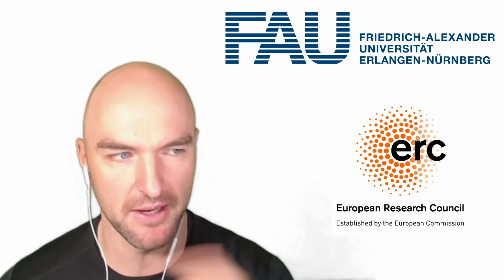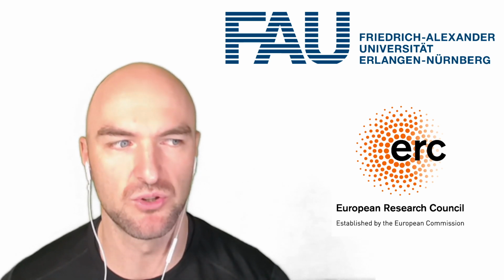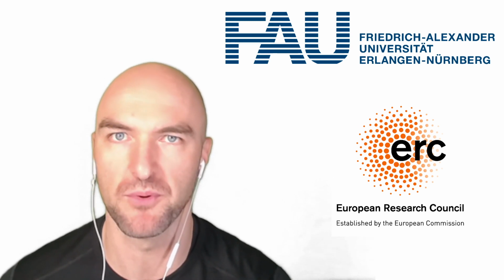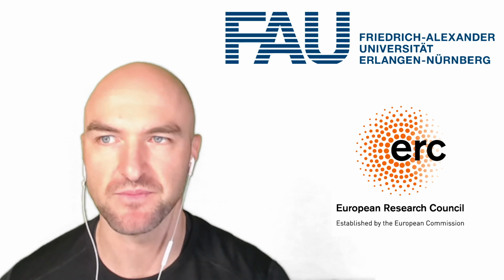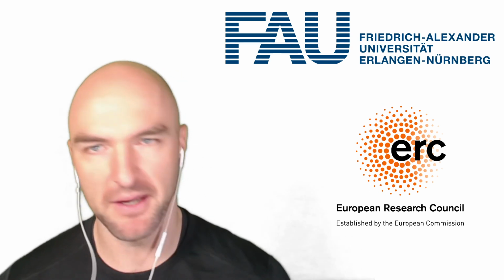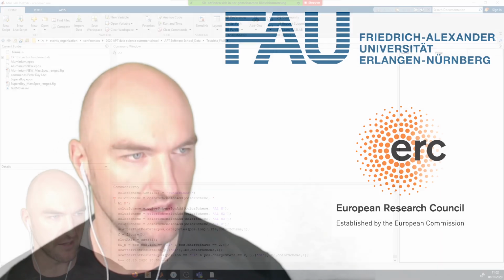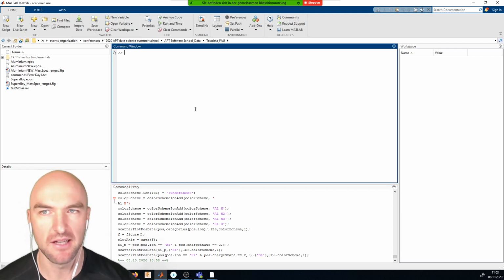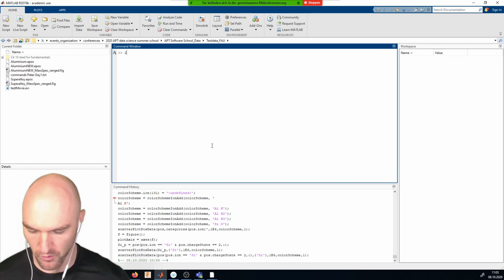because this will open up some time in the next session to get a little bit more creative with all kinds of generalized analysis, spatial analysis, and so on and so forth. But very often the basis of everything is actually having regions of interest and the like. So we'll do what we always did before.